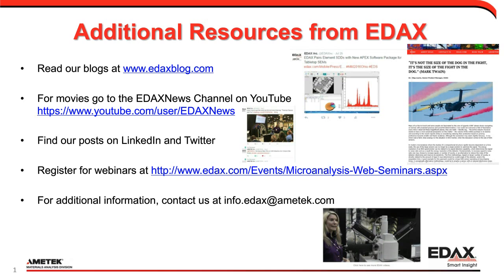So the single calibration corrects for any range of kV. The lower aluminum energy peak that we calibrate for is at 1.486 keV, so even at the very lowest conditions, it's calibrated. If you're working at extremely low conditions, we also have an ICC shift correction that works for our carbon peak, as low as carbon. So one calibration is used for all different accelerating voltages.